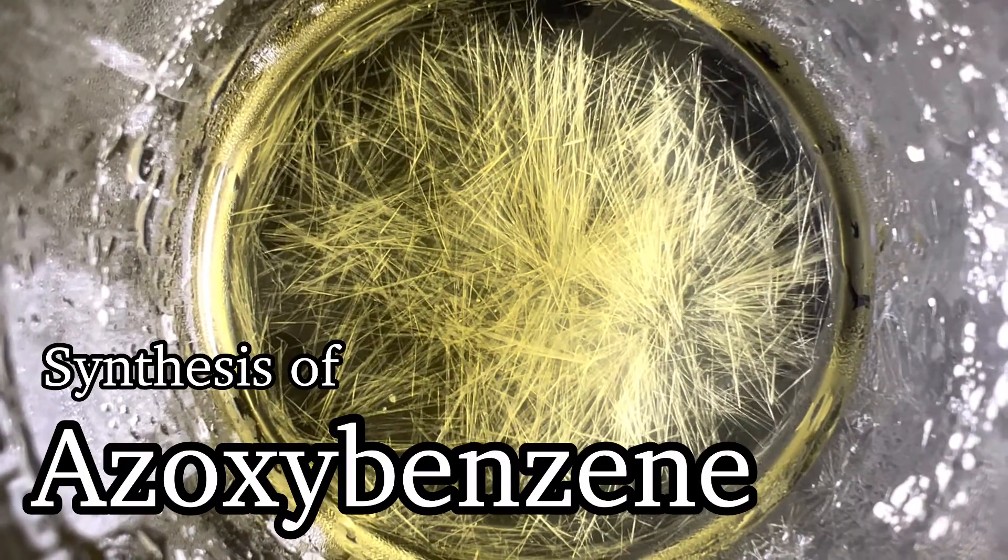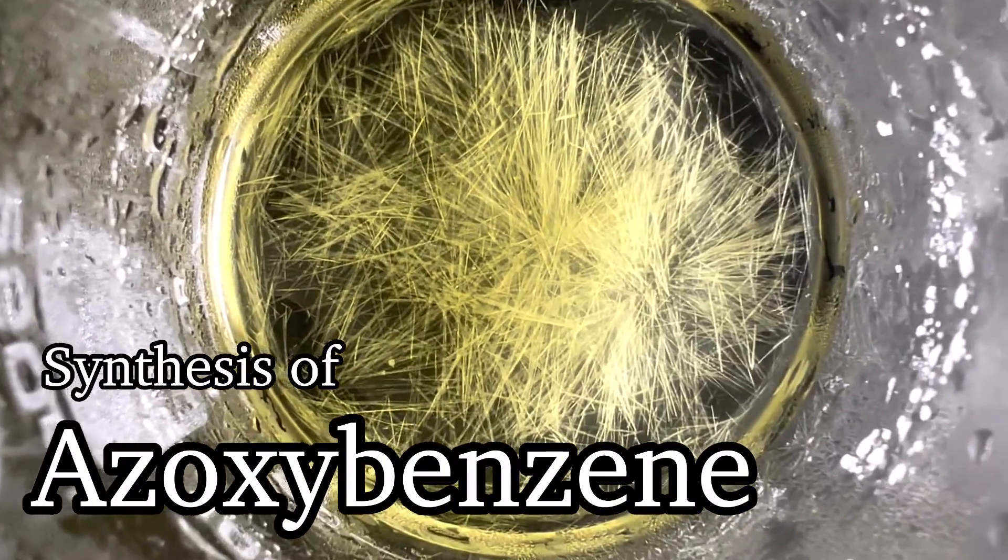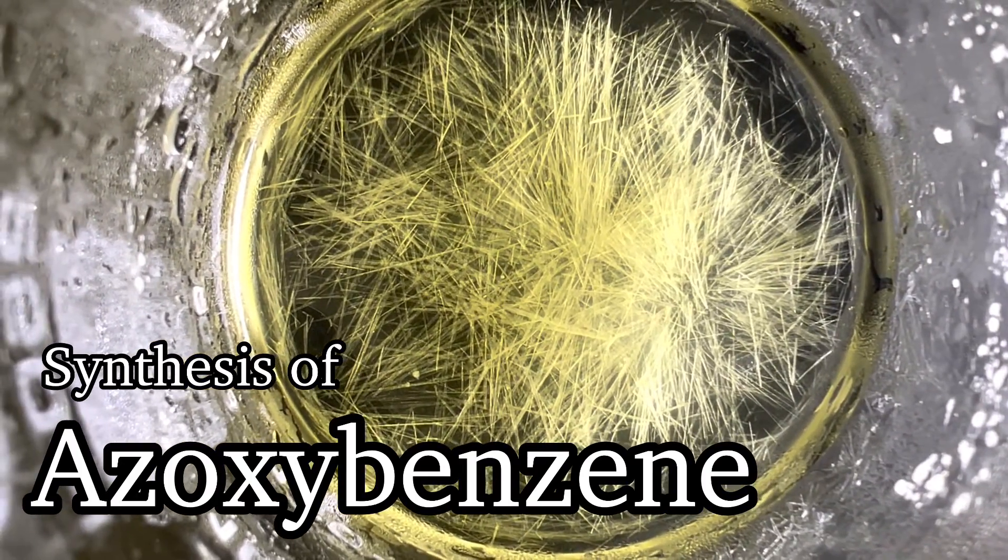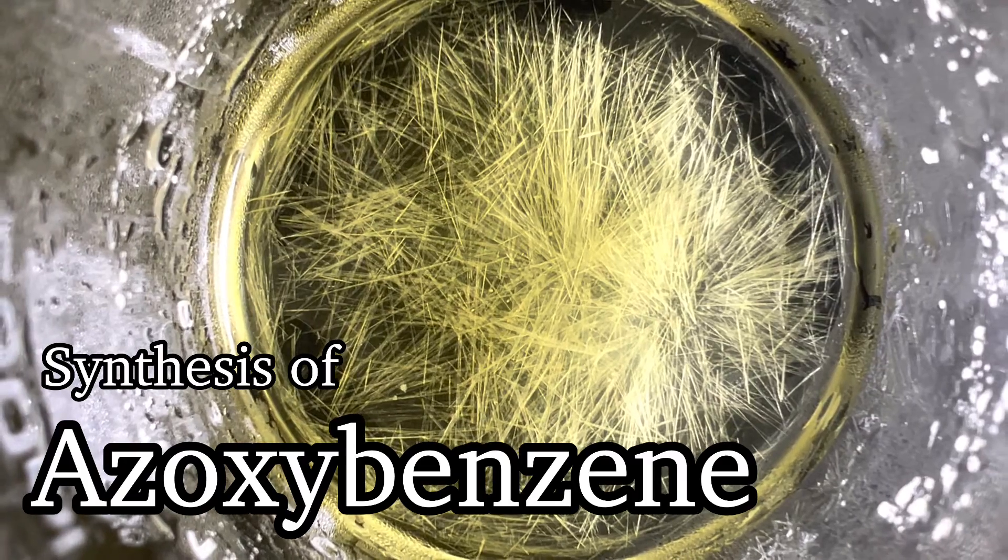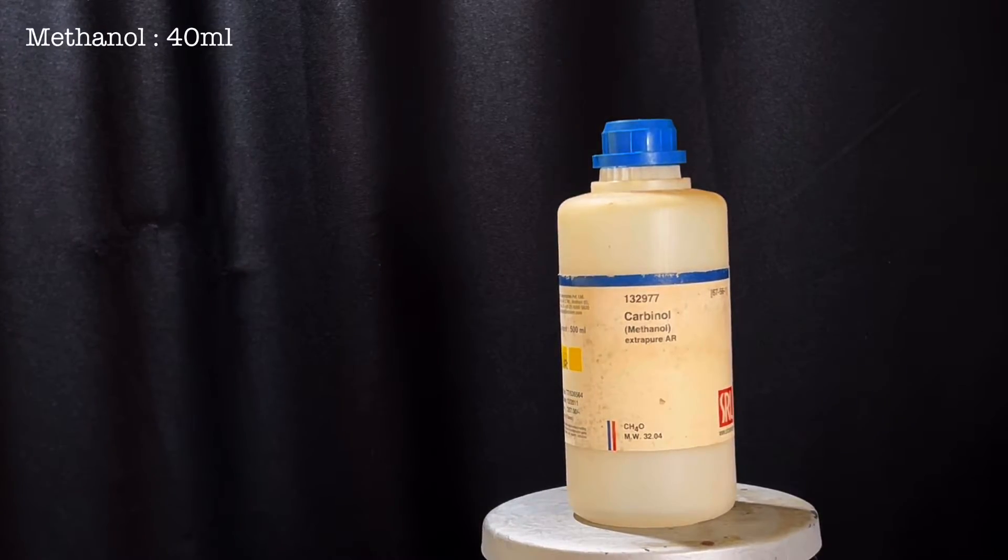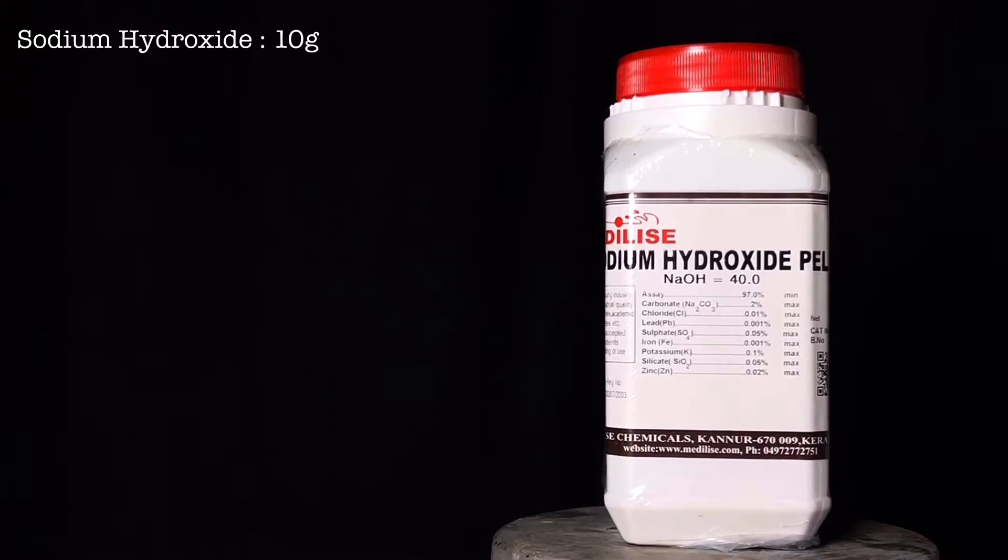Hello friends, in this video we will be synthesizing azoxybenzene by the partial reduction of nitrobenzene with methanol in the presence of sodium hydroxide. Chemicals required for this synthesis are 40 milliliters of methanol, 10 grams of sodium hydroxide pellets, and 6.2 grams of nitrobenzene.